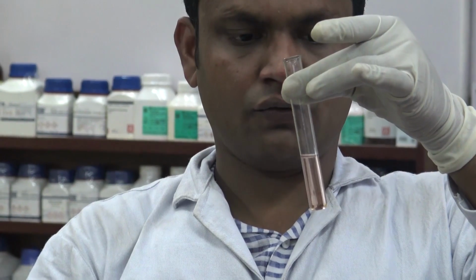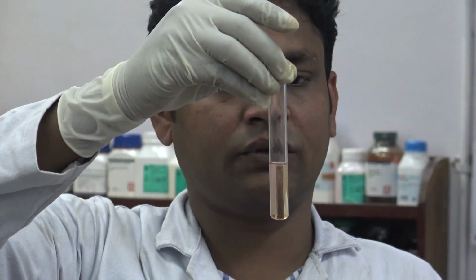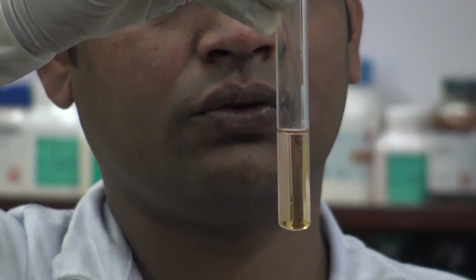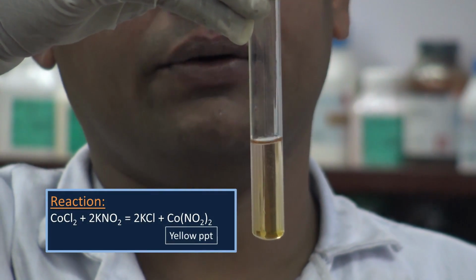And keep it for few minutes. The color will slowly change to yellow, which will confirm the presence of cobalt ion.